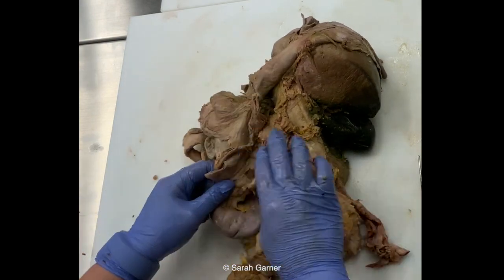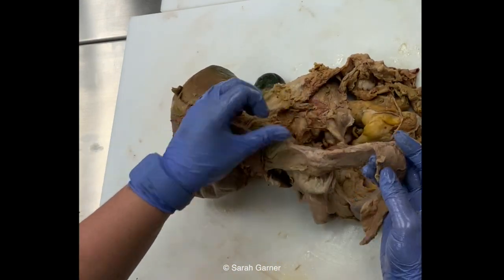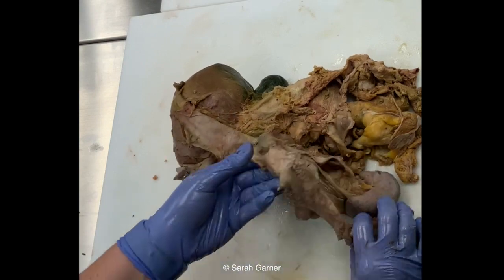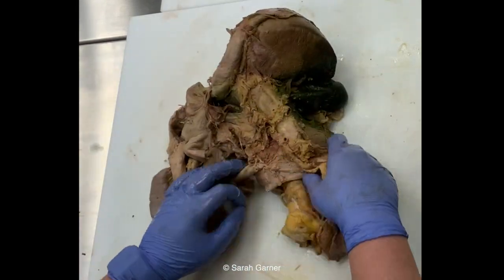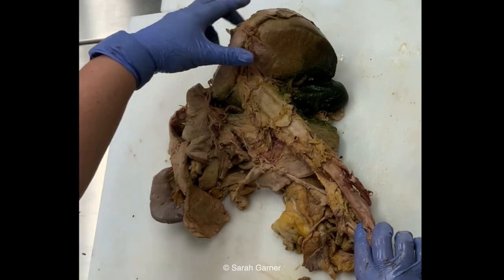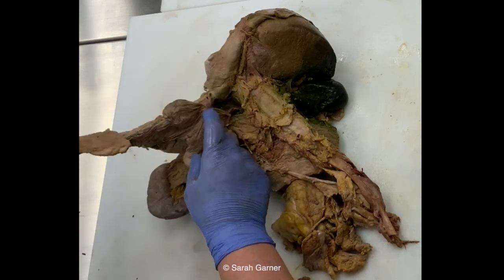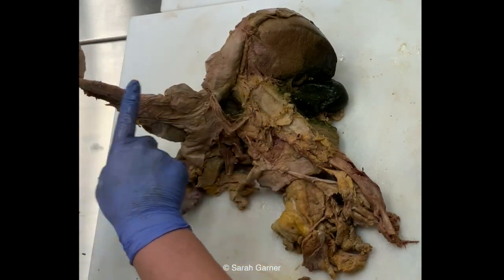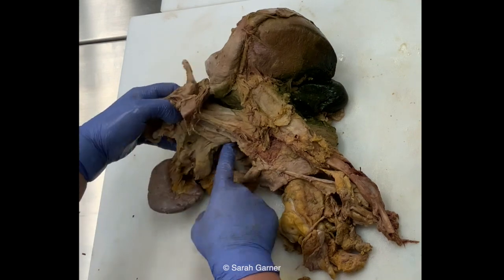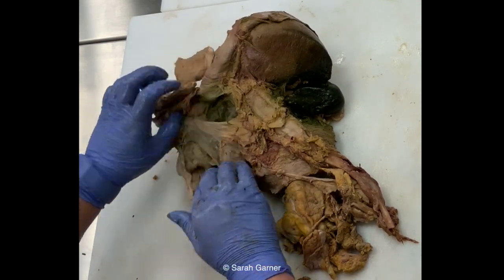So at this point, we have a lot of tissue, but not that many organs left. So we can go ahead and clean it up. Here, this is still a posterior view, right? So this would be inferior vena cava, liver, diaphragm, gallbladder. And then over here, we've got a remnant of diaphragm. This would be esophagus and stomach. And then here we've got pancreas and spleen. So you can just start to separate the organs out.